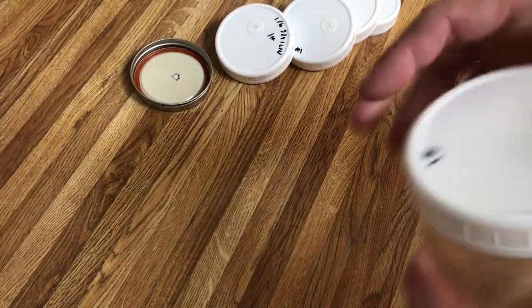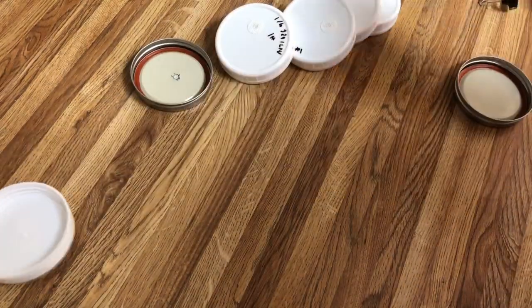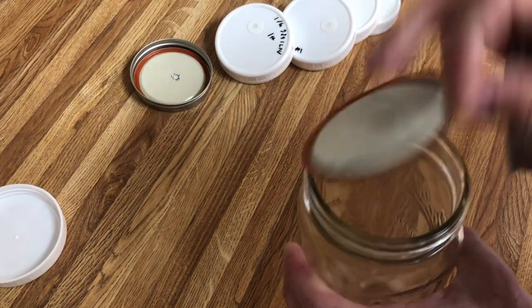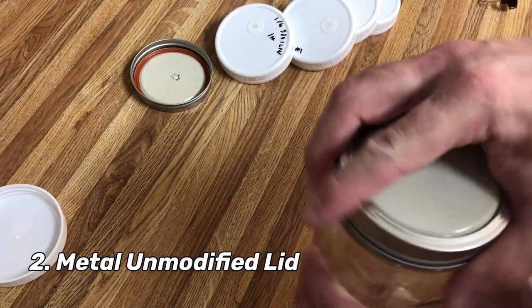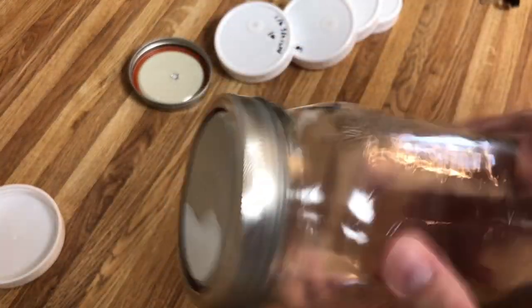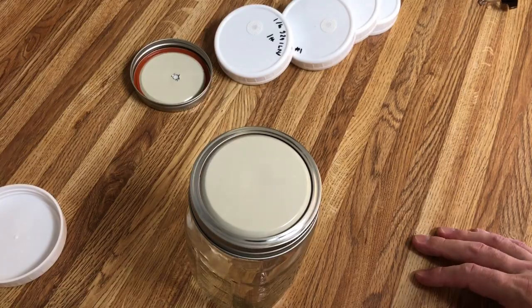And then the other option is to use a standard metal lid. And typically you'd flip this so it doesn't suction itself closed. It's easier to get off. Same thing, tighten it, back it off a little bit. There you go. You can pressure cook just like that.